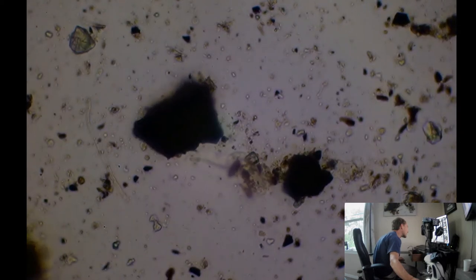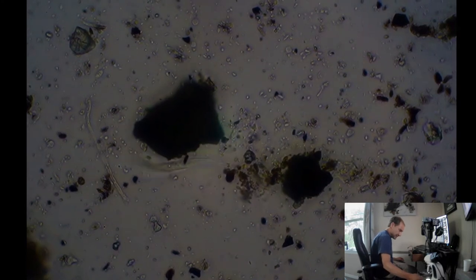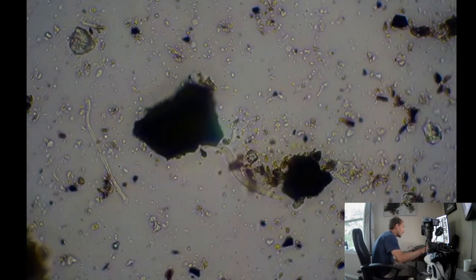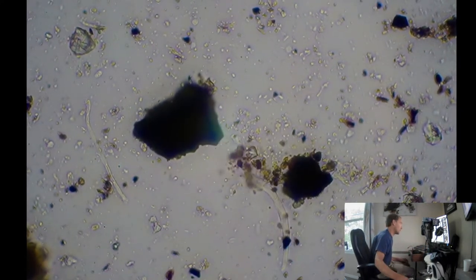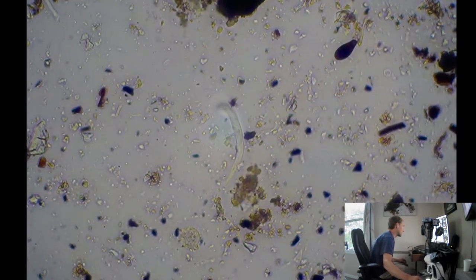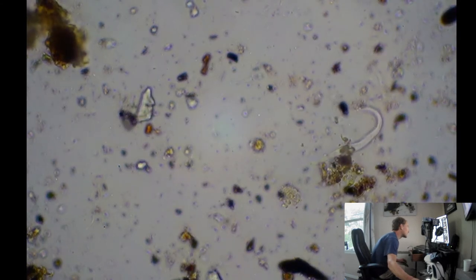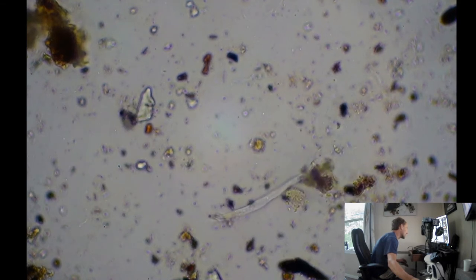And let's see. Let me put a little bit more shading, just our light a little bit. Ooh, yeah, there we go. Need a little bit more light. Let's see if we can identify him. So what we want to look for is his mouth, which is down over here the way he's going. So yeah, he doesn't have a real pointy mouth. So that's an indication of a bacterial feeder, which is the kind we want to see, and not a root feeder.